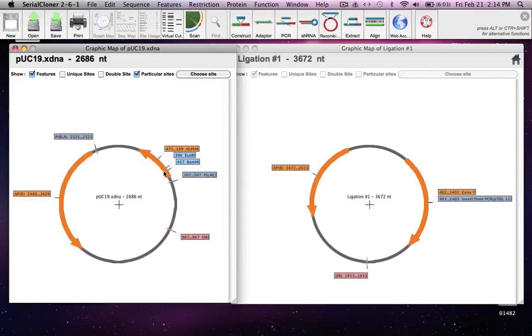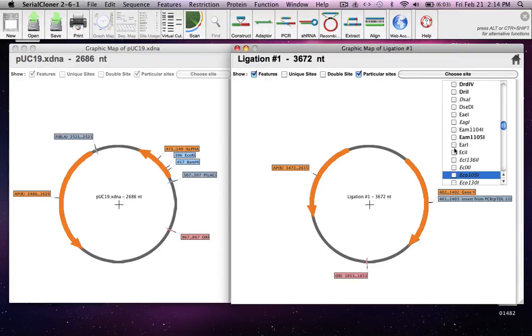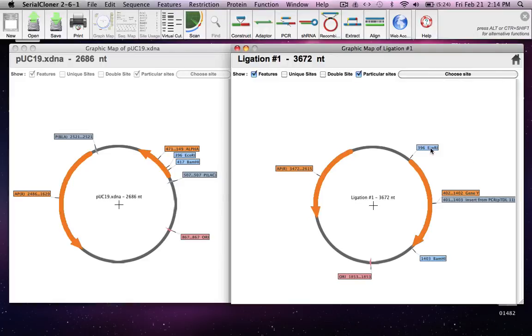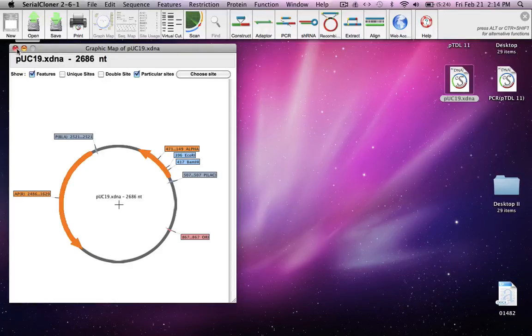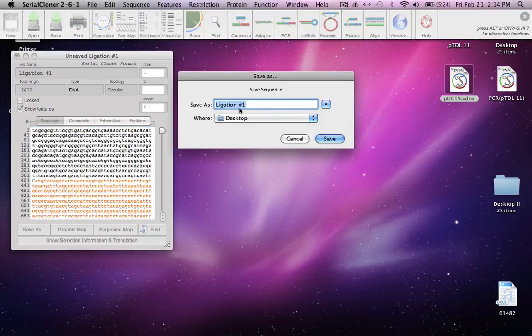The other difference is that the size of the plasmid has increased in our construct by exactly the same amount as gene Y. To confirm gene Y is inserted at the right position, we look for ECO R1 and BAMH1 in the parent PUC19 — they show up in the blue boxes at the multiple cloning site. In our construct, ECO R1 and BAMH1 are present and gene Y is inserted between them at exactly the right position. We'll now save our construct — save as — and leave the name as ligation number one.